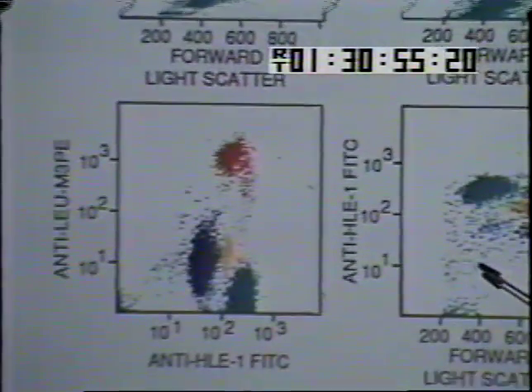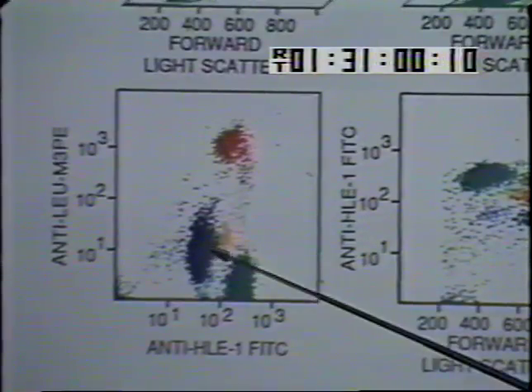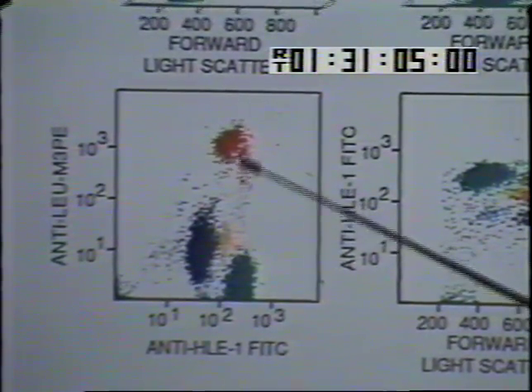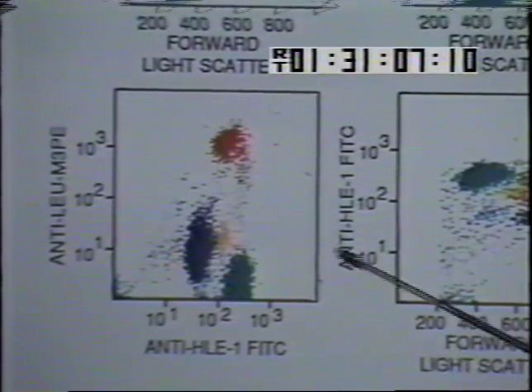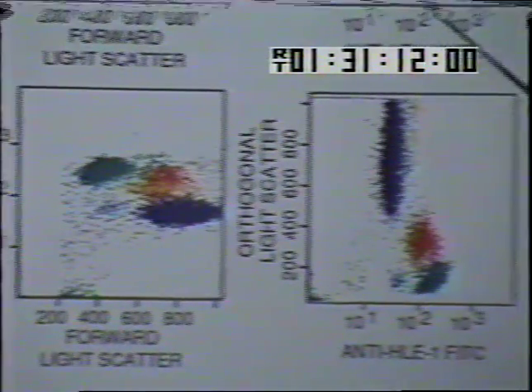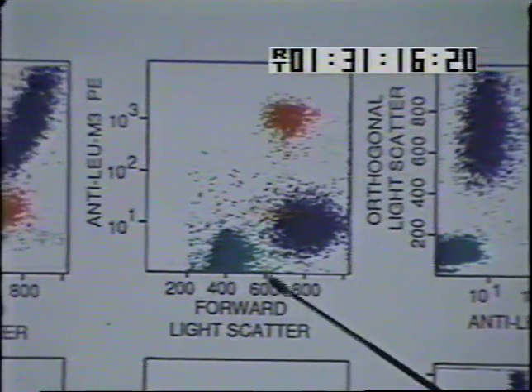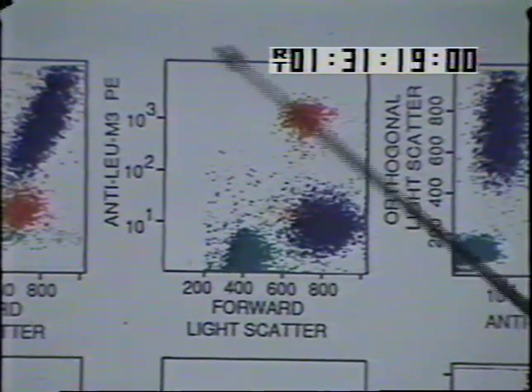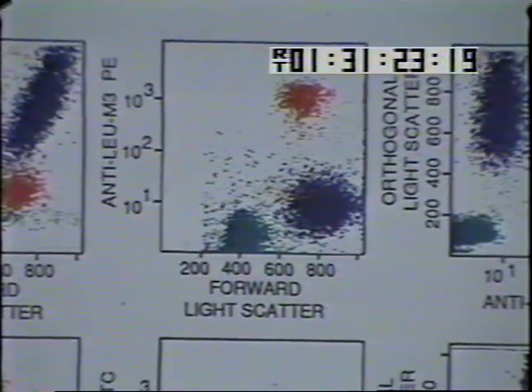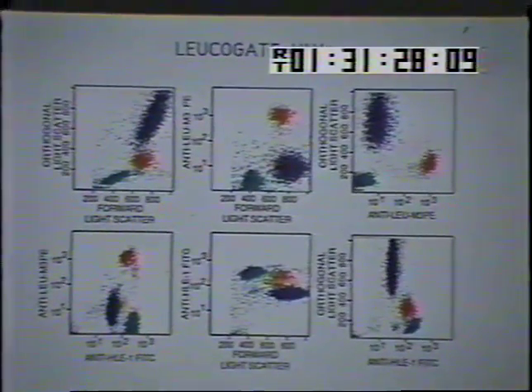The power of the flow cytometer is the fact that we can make multiple correlated measurements. So in this case now we see the neutrophils, here we see the monocytes, and here the lymphocytes. All of these panels represent the cells displayed in different parameters. So in this case we're looking at size versus the display of a certain antigen. These pictorial representations show the power of flow cytometry in its ability to see the multiple dimension of a cell's properties.